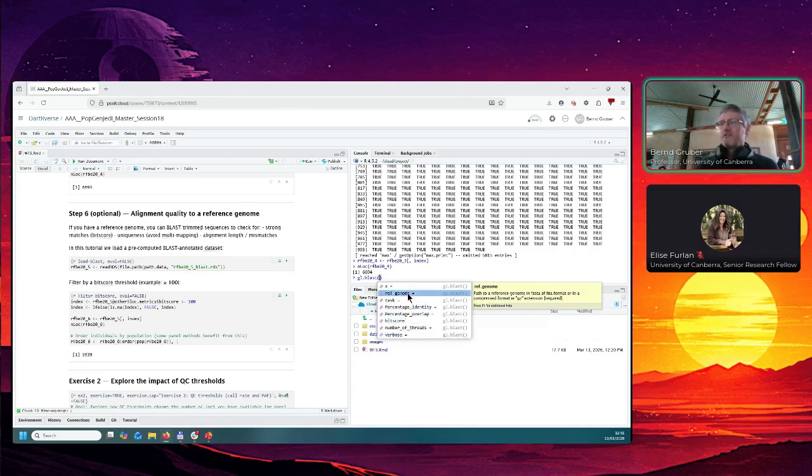But now, how well it hits to the reference genome matters, and here it's important again that we filtered for the length of the sequence, at least 30, before. So we get hopefully only SNPs which have a really nice hit. And we use a bit score higher than 100. So there's basically no question that it is the right hit.